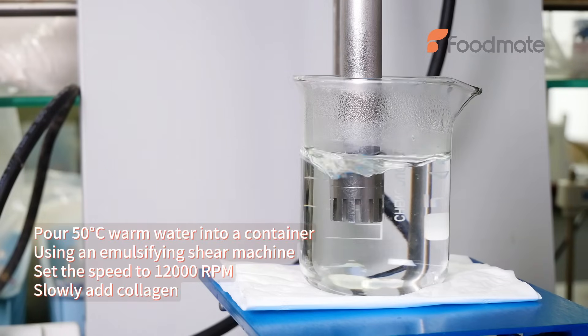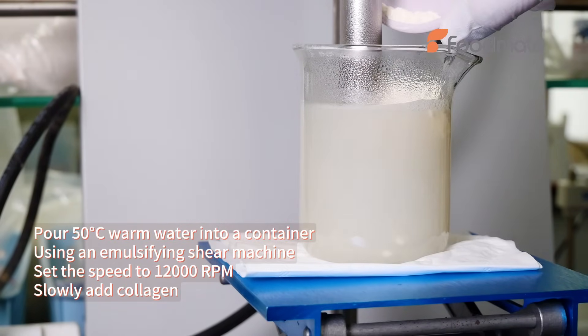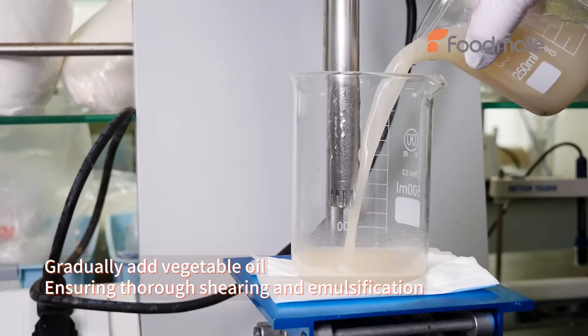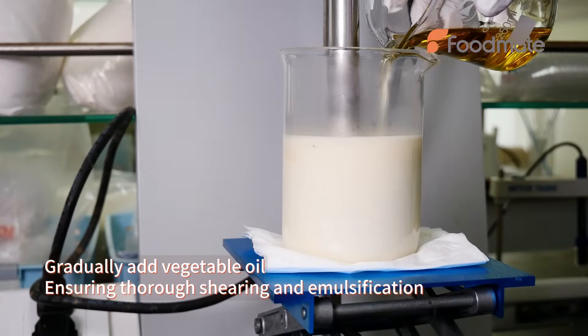Pour 50 degrees Celsius warm water into a container using an emulsifying shear machine. Set the speed to 12,000 rpm. Slowly add collagen, then gradually add vegetable oil, ensuring thorough shearing and emulsification.